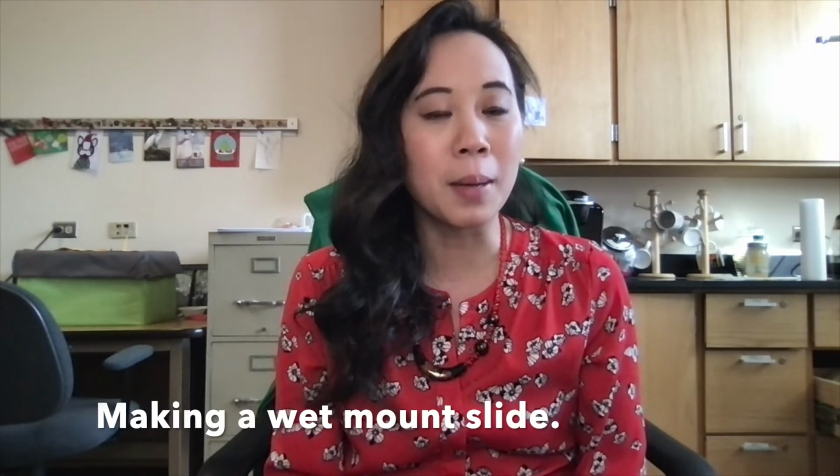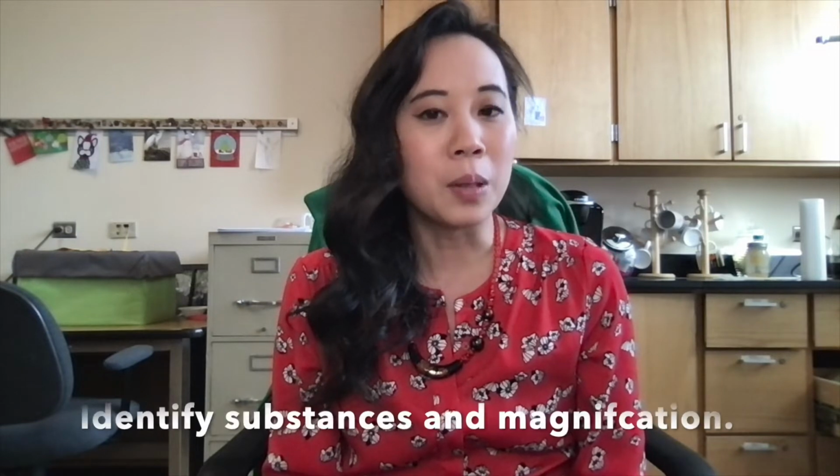Hello, we are going to wrap up our biology unit with a lab practical. For this portion of the lab practical, you will be assessed on your ability to make a wet mount slide, your ability to document your work through microscope photography, and your ability to identify substances and its magnification based on your data.